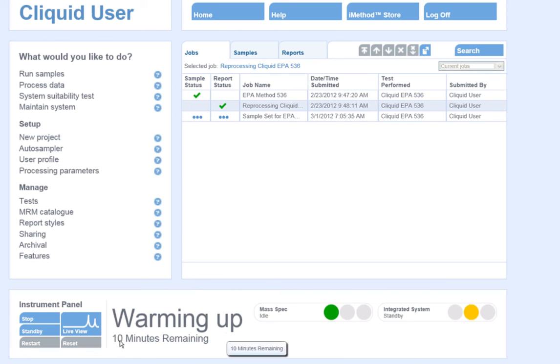I have a clock at the bottom of the screen that will count down the equilibration time, so I can see how long it will be before my first sample is run.